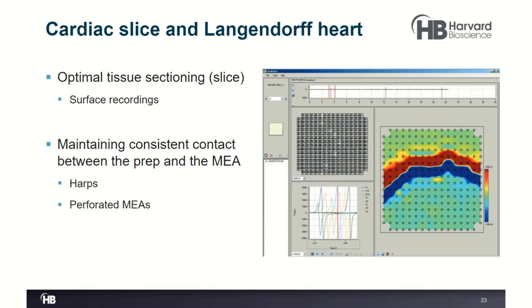For Langendorff heart preparations, you need a good mechanical manipulator to hold the flexible MEA in place so it doesn't wobble, and strong contractions can also cause movement and reduce recording quality. Some flexible MEAs made of polyimide have a similar flexibility to hair, so they move with the heart and contractions do not significantly affect system noise.